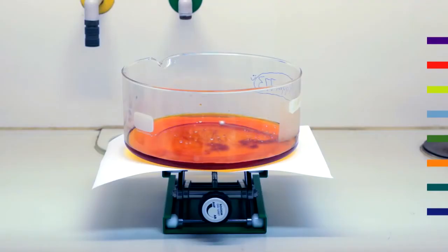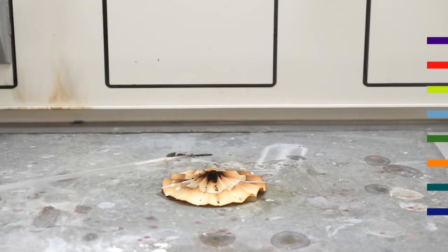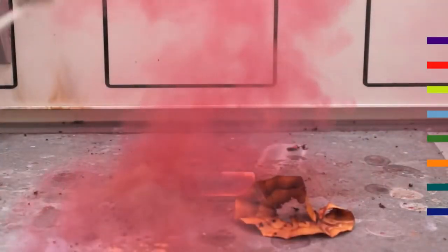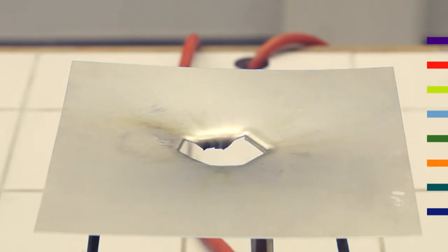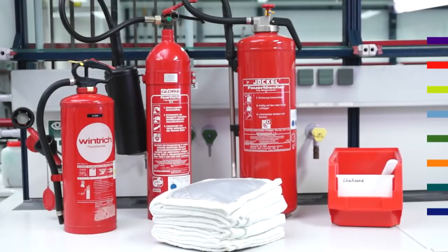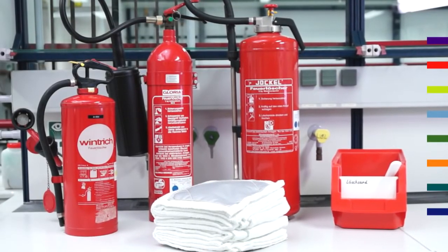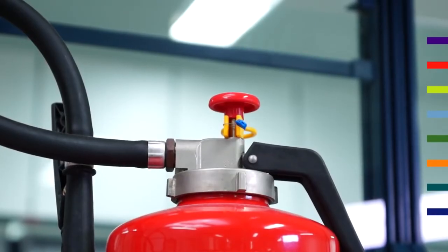Self-inflammable chemicals may ignite when in contact with air and water. They are, for example, alkaline metals and hydrides, and also silanes. Shock-sensitive chemicals carry the danger of explosion. Nitroso and nitro compounds, azides and fulminates require careful handling. Shock, friction, and solid inclusion must be avoided in all circumstances. In order to react quickly in case of fire, it is important to inform yourself about the fire extinguishers in the laboratory and how to use them.